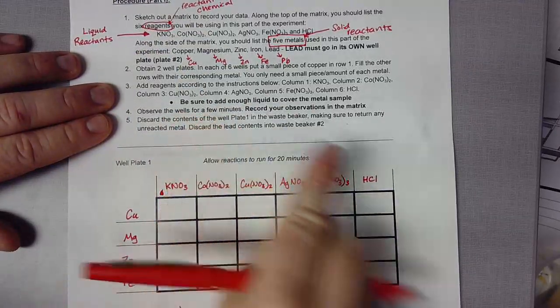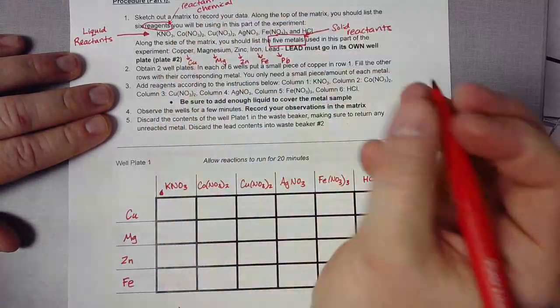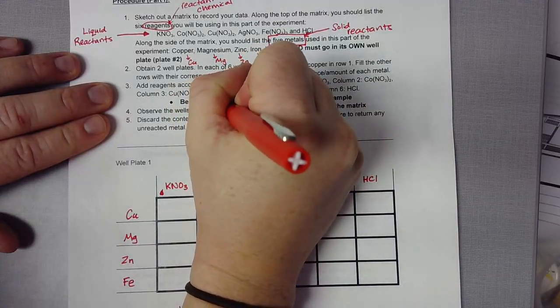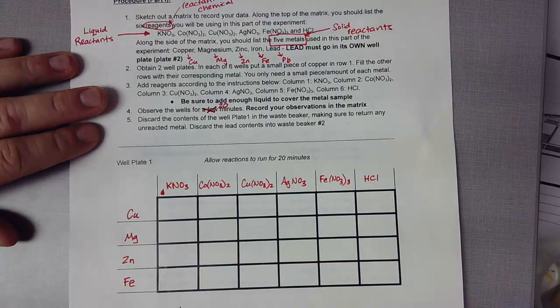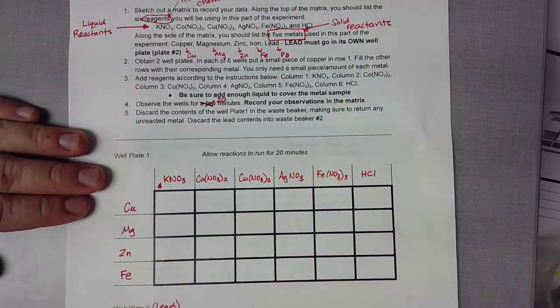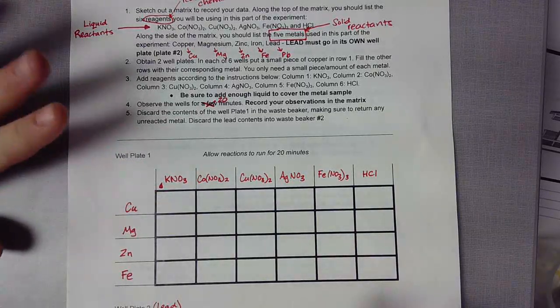Observe the wells for a few minutes. Record your observations in the matrix. Now, not a few minutes. We are going to observe the wells for 20 minutes. The run time of this experiment is a total of 20 minutes. Now, during those 20 minutes, you are constantly making observations. If nothing happens, leave the box blank.